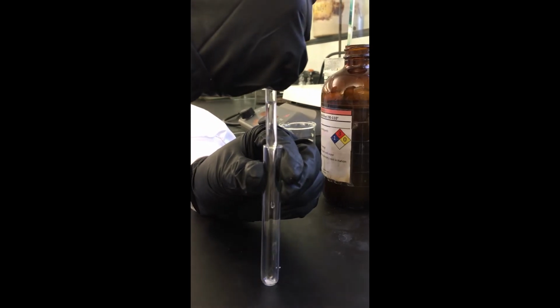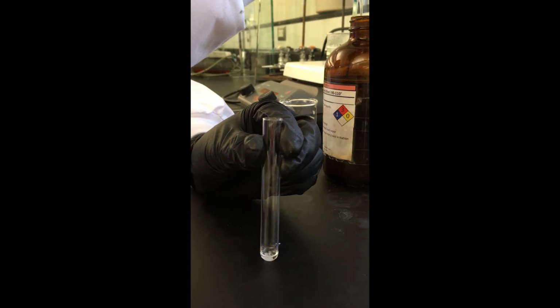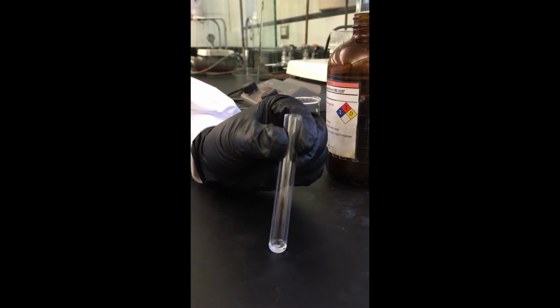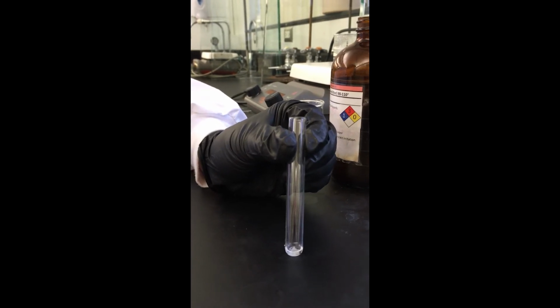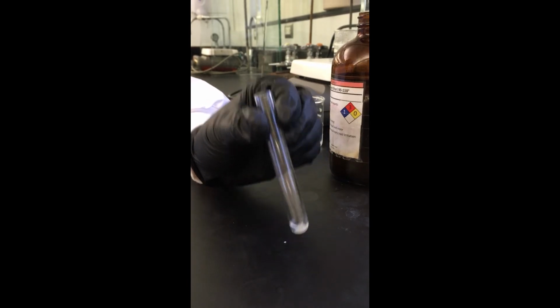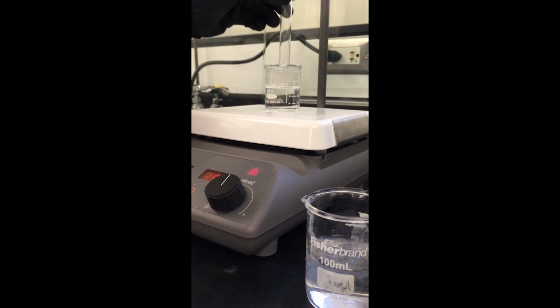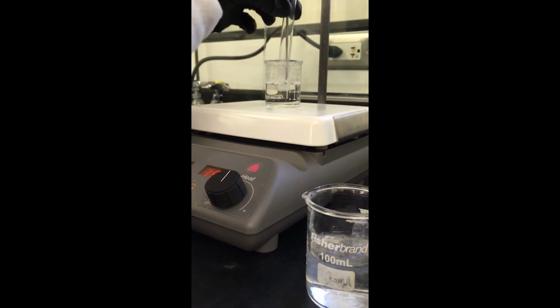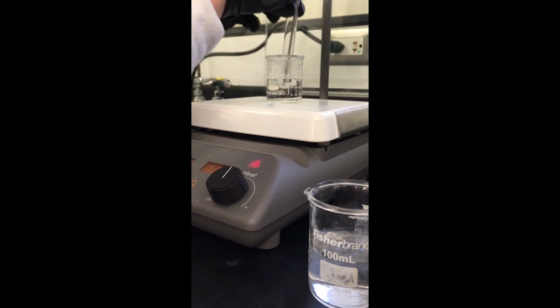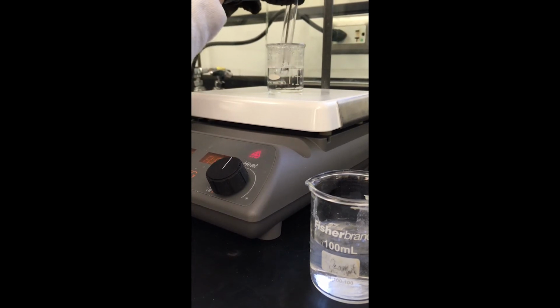I'm just going to go ahead and add a small amount of ligroin at first. We can add more later if we need to. But I'm just going to take this and heat it up until the crystals dissolve, and then I'm going to cool it off to get the crystals to reform. Okay, so we're going to take these crystals that are in ligroin and immerse it in this hot water bath and stir it up. And we're doing this to get the crystals to dissolve as best we can.